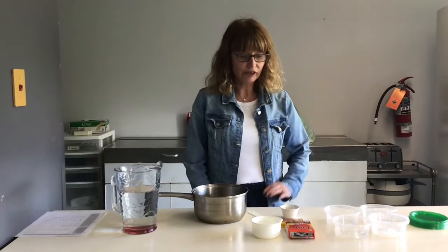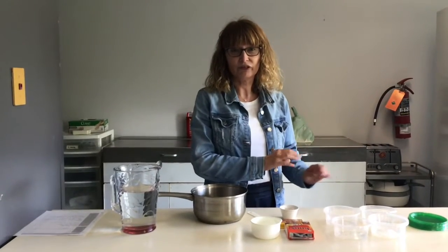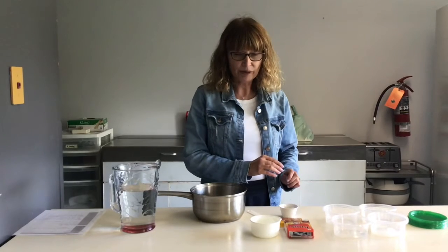Hi, today we are going to make agar for petri dishes, and once the agar is made, we're going to be swabbing the counter with different cleaners to see which cleaner cleans the best.